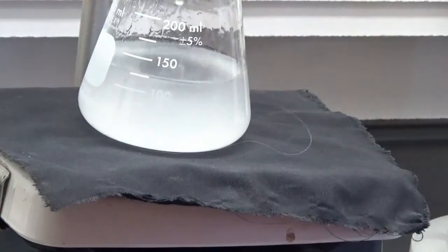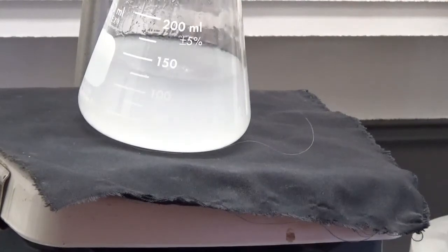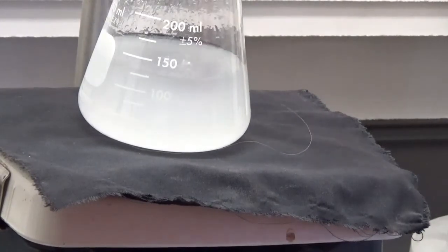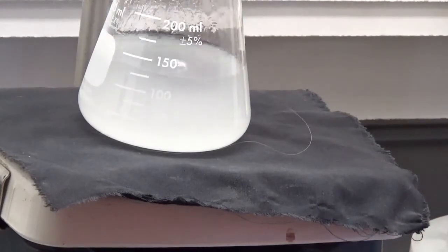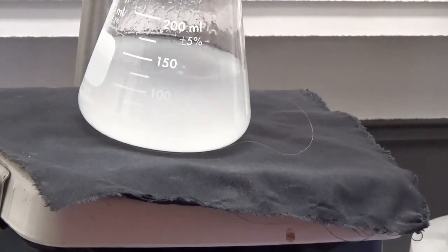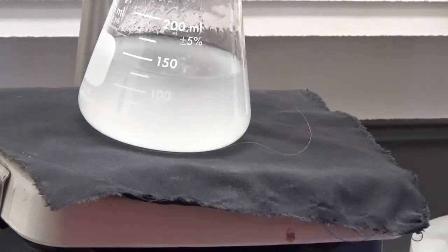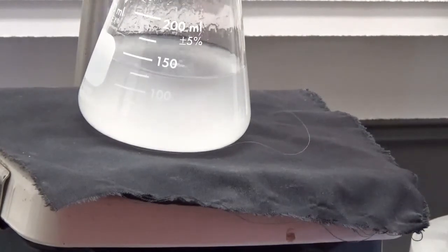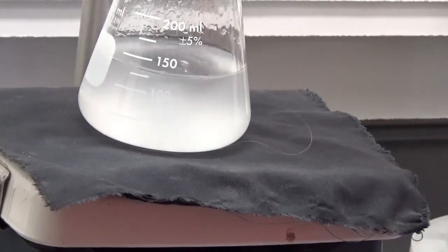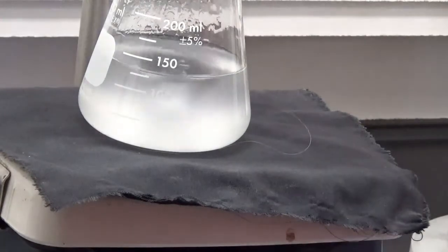It's cloudy. Start adding acetic acid. There.